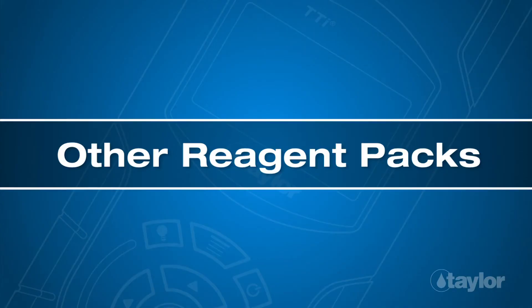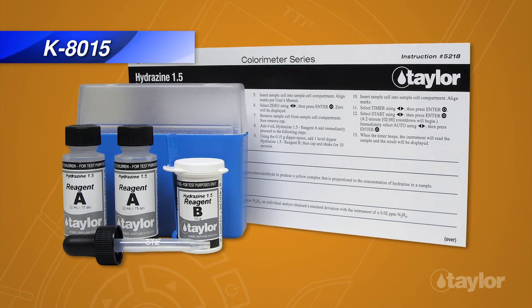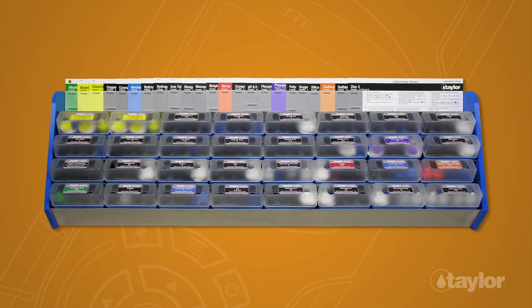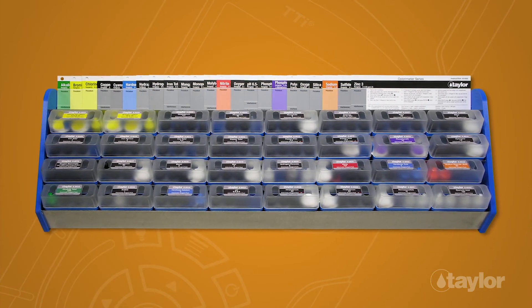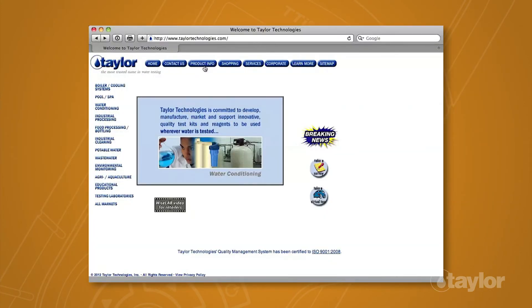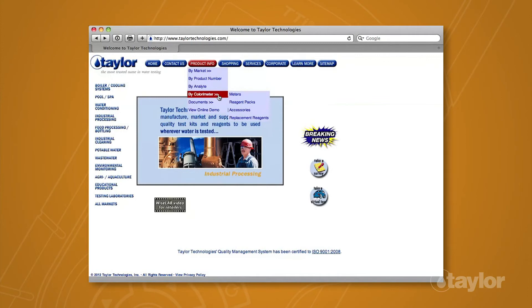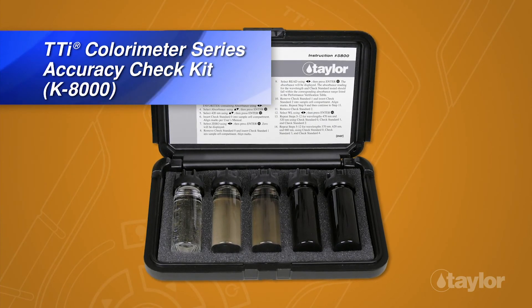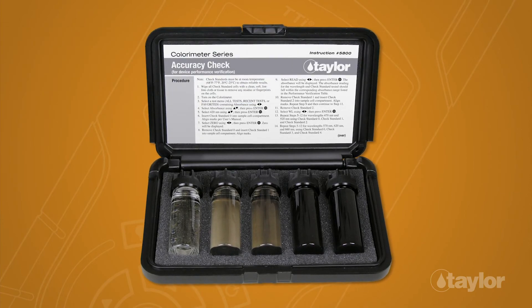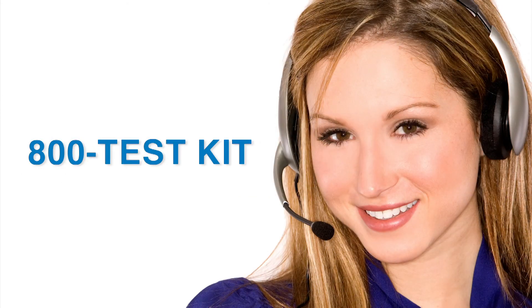In addition to the K-8015, Taylor manufactures many other tests for the TTI colorimeter series. To view the complete listing, choose the Product Info button, go to Buy Colorimeter in the drop-down menu, then select Reagent Packs for your meter model. We also make an accuracy check kit, which should be used periodically to check instrument performance. Taylor's knowledgeable customer service representatives are available to provide technical assistance about our products. Call 800-TEST-KIT.